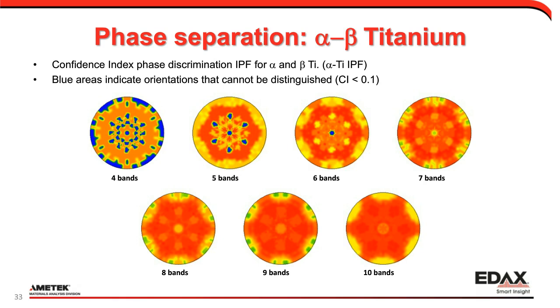But you can see that 6 bands gives you better orientation and precision around the outside, whereas the middle is not great. And then it goes back and forth: it gets worse, it gets a little better, it gets worse, and then it gets better. I honestly don't know the specifics as to why.